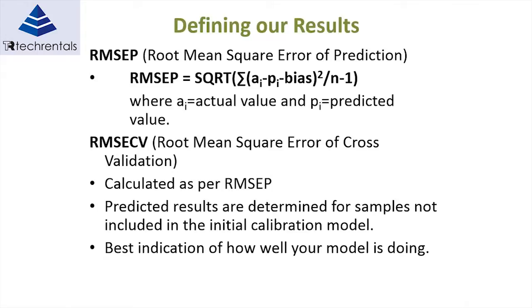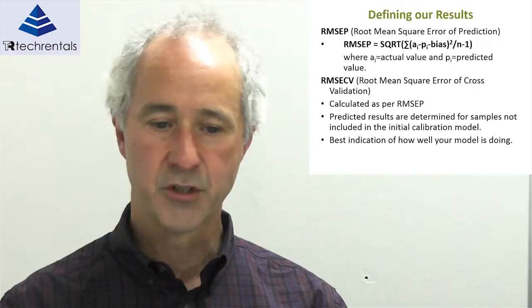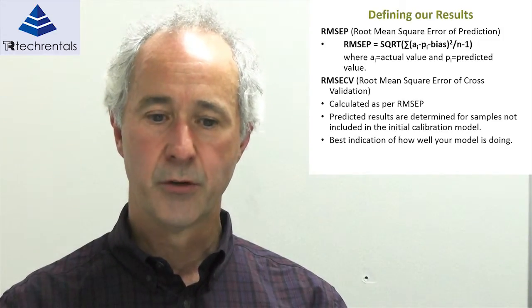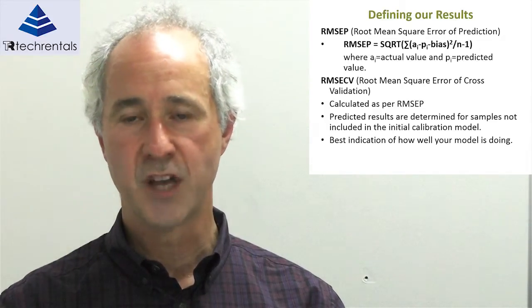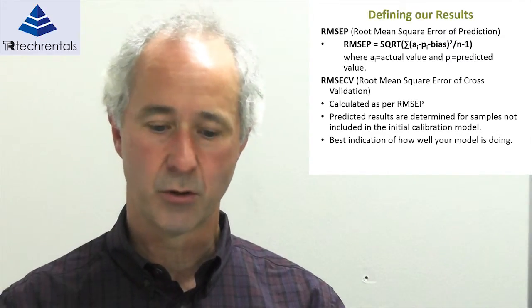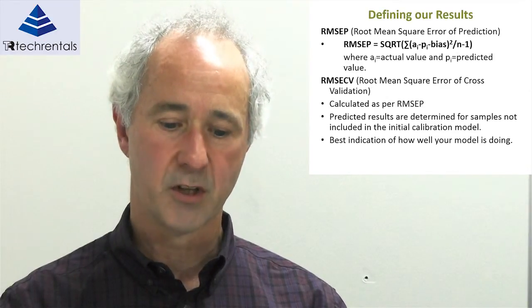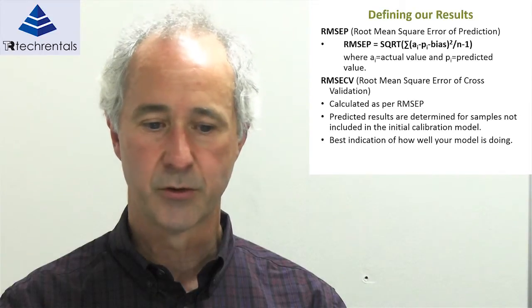So that's why you need to run validations reasonably continually, depending on the process and how confident you become in the process itself. Once again, I mentioned before that you can detect through mapping that the new samples are no longer fitting the original model. So there are indications that something is not quite right. But to be very confident, you need to continually do validation samples.